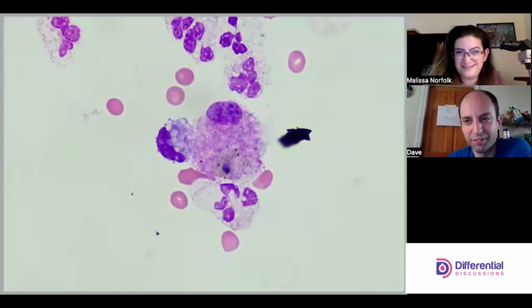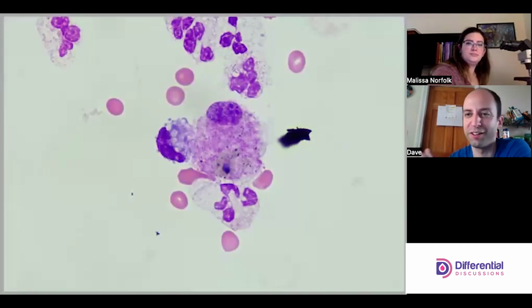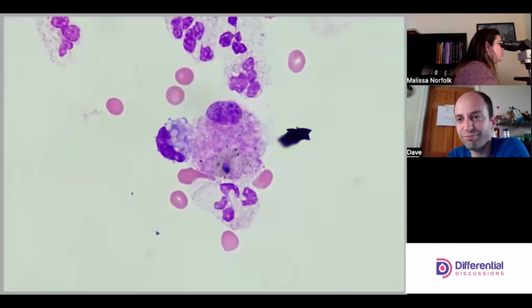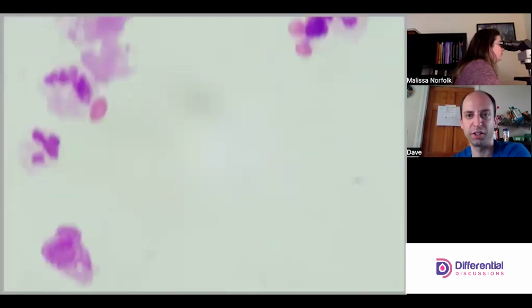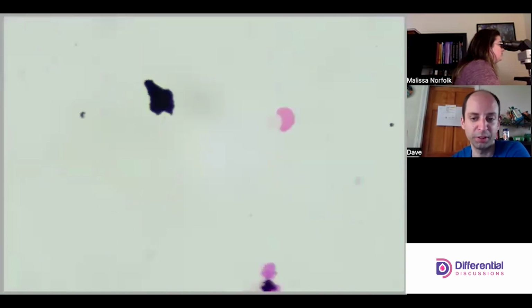You don't really ruffle as many feathers when you say there's bacteria on a slide like this. I also wouldn't judge it based off those two little things in there. I looked around more and haven't seen anything else like it. It's way more likely that you'd see it numerous in something like a BAL, in my experience.